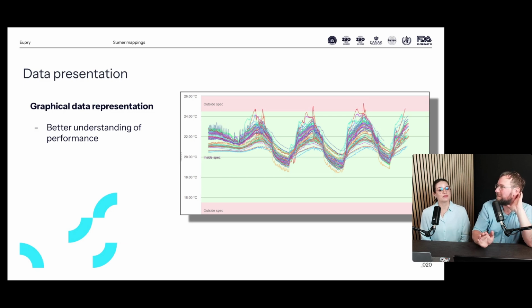So you would often get the data out of the wireless sensors and just follow along and see whether everything is roughly as it should be, especially if it's for many, many days. Exactly. It's very good to follow the data while it's going, not only wait 14 days and then by the end check how it is. That's not doable, and it's not good for anybody.